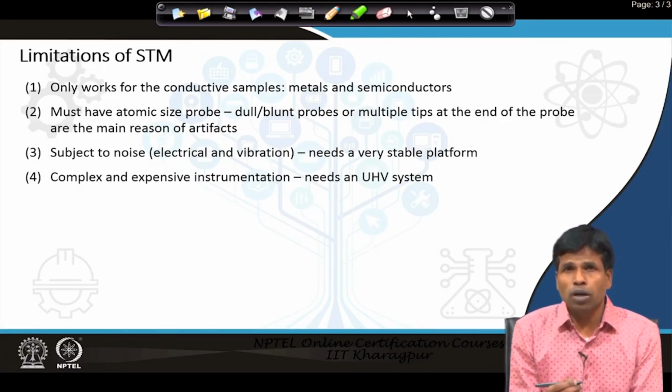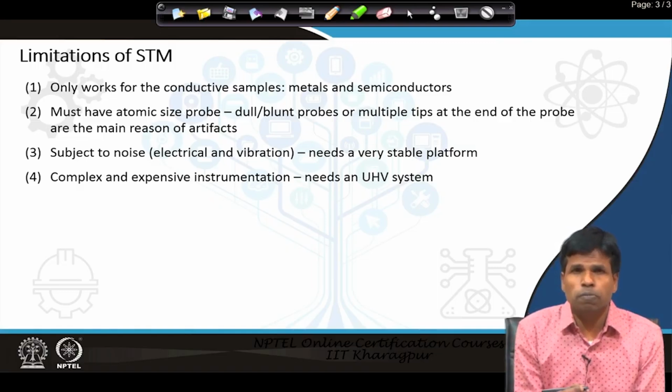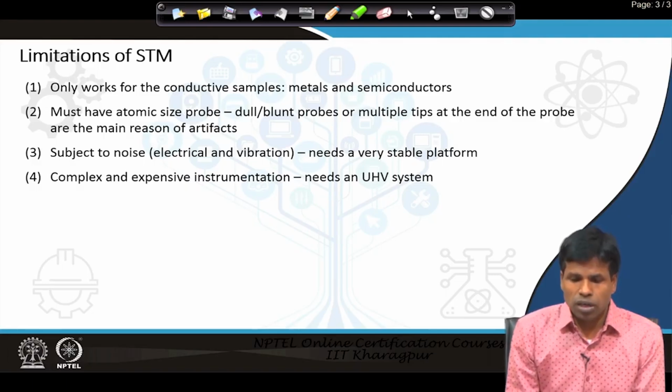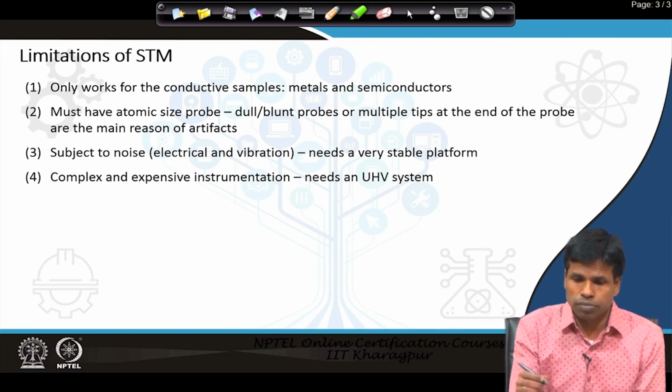If we take any sample to study under the microscope in any environment, the sample surface will automatically be contaminated by the environment, forming different types of layers on the surface. Then we would actually be examining those contaminants on the surface rather than the real sample. So, most commonly STM is studied under an ultra high vacuum system or chamber.